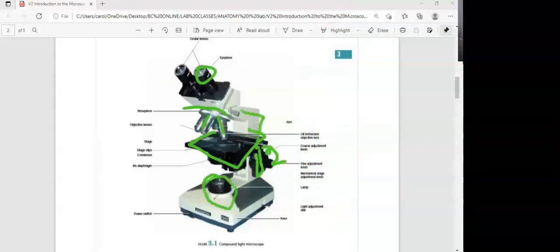This is the light source. This is the base. Down here, you have the condenser with the diaphragm in there. These lenses are going to have different values, right? 10, 4, 40, 100, etc. I know it's not that clear here, but they have a line.